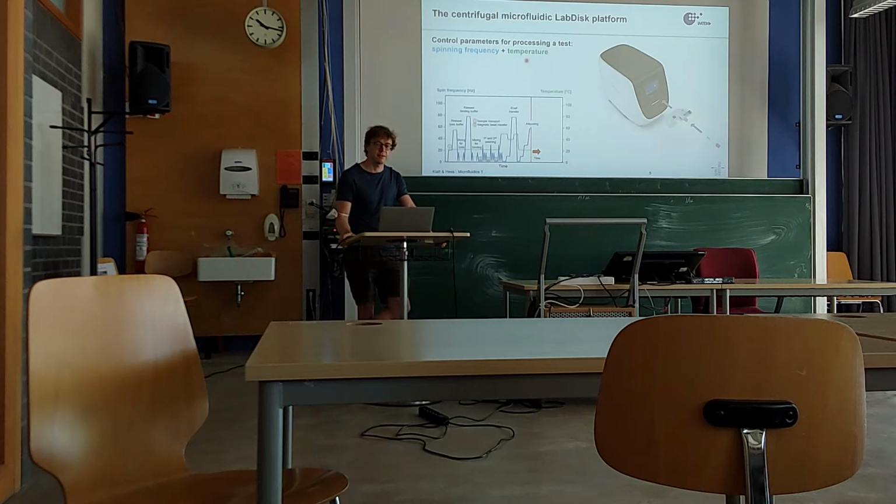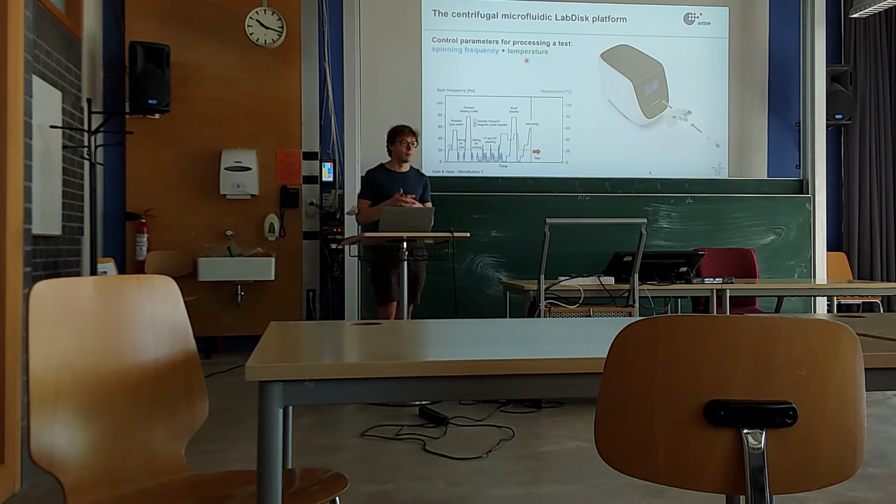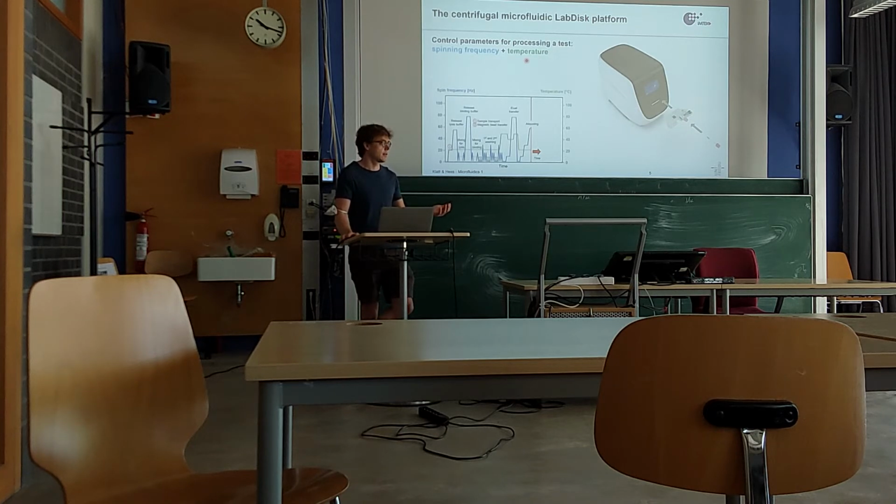Do you have an idea why this is of importance? Incubation? Yeah. So the incubation, that's one part why it's important. And if you want to state it more generally, most of the time we do biological applications on our cartridge. And there you often require temperatures to work with your enzymes. So, for example, if you want to do a SARS-CoV detection, you have to do a PCR. And for the PCR, you obviously also need some temperature steps that you have to control.